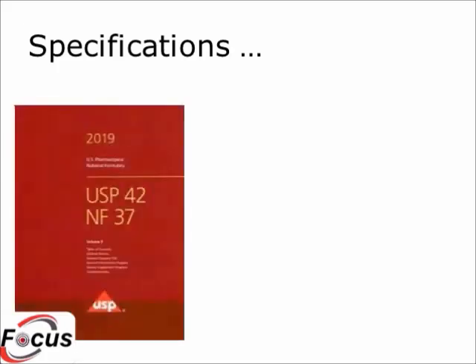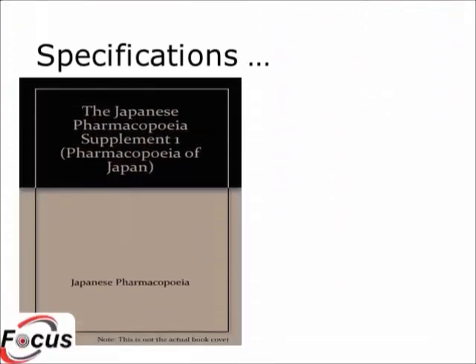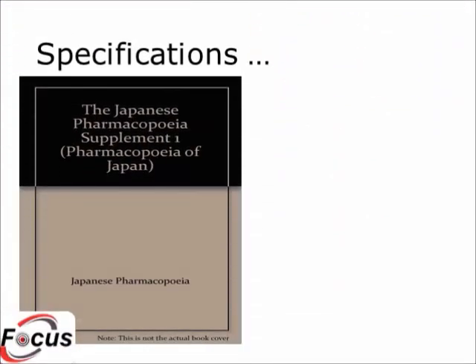Raw materials are analyzed according to pharmacopoeia specifications. The most common pharmacopoeias used are United States Pharmacopoeia, USP, and British Pharmacopoeia, BP. Also Japanese Pharmacopoeia, or an in-house, supplier specification. After approving the raw material, it will be released to manufacture the finished product.